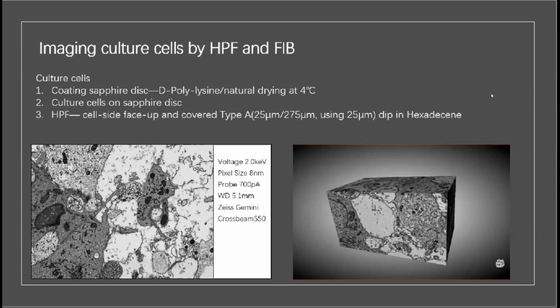But in this case, the researcher didn't think the contrast was good. So when we read the picture, we used his preparation method, and we rehydrate the sample to room temperature, make the water in the sample again, and dehydrate again, and make staining lead.